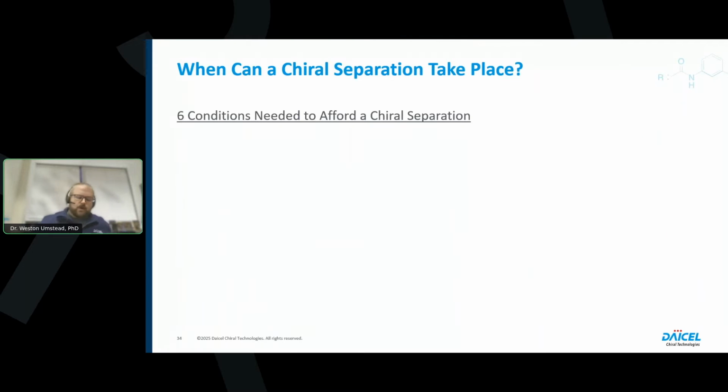So we talked about the separation mechanism for achiral, where it's mostly polarity. Let's talk about what it looks like for polysaccharides.